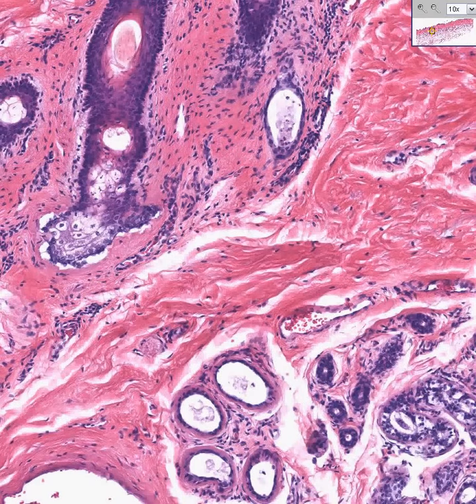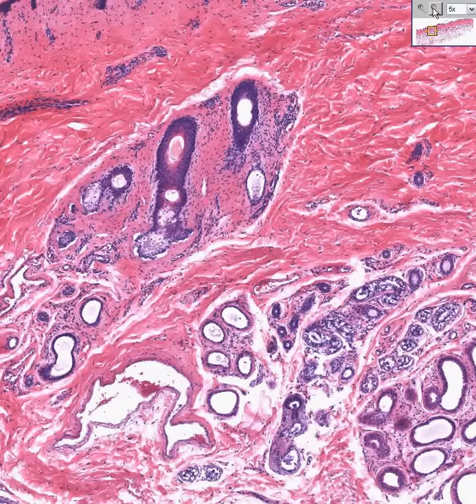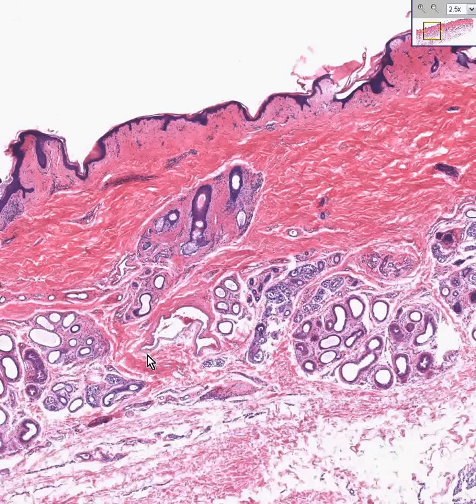And once again, because we're talking about shotgun histology here, I would like to leave you with the feeling at the end of every session that there is not a single thing on any of these slides that you can't identify. If we put a shotgun through the skin and looked at everything under each dot, we would know exactly what the structure was. In this case, epidermis, papillary dermis, reticular dermis, hair follicle, apocrine sweat gland, eccrine sweat gland, loose connective tissue or fatty connective tissue of the hypodermis. And that's the end of this one.